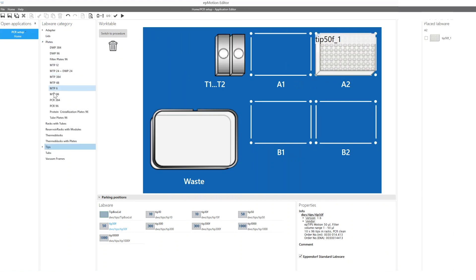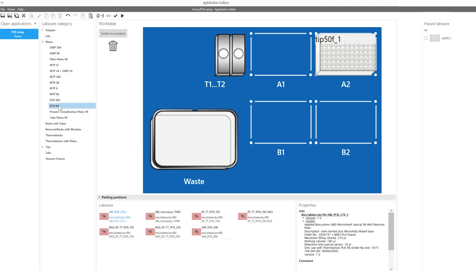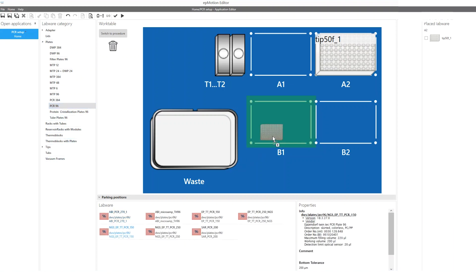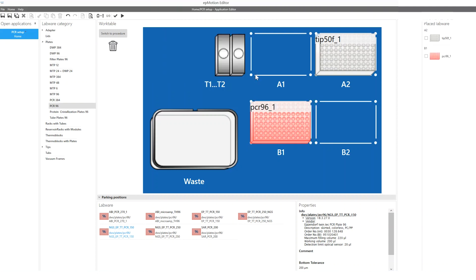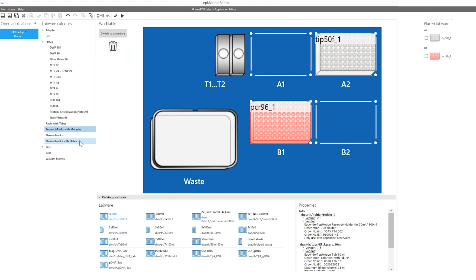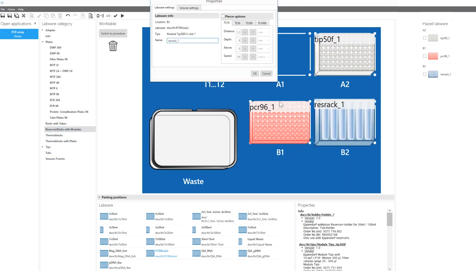The work table of the EPMotion 5070 can be easily configured with EP Blue software. You just need to select the labware types you would like to use for your PCR setup and place them on the desired deck positions simply by drag and drop.